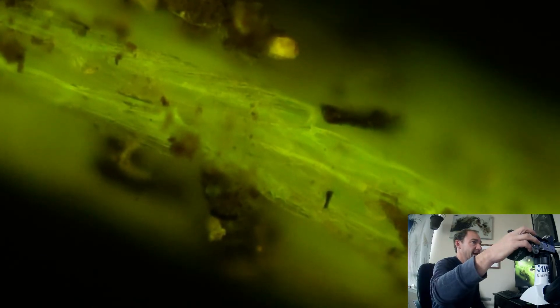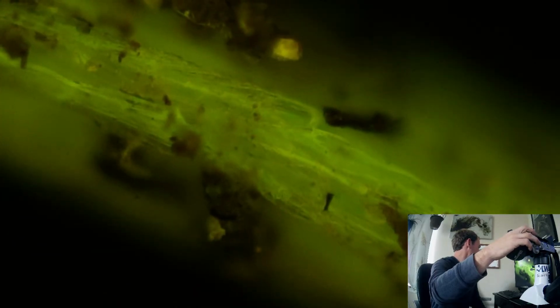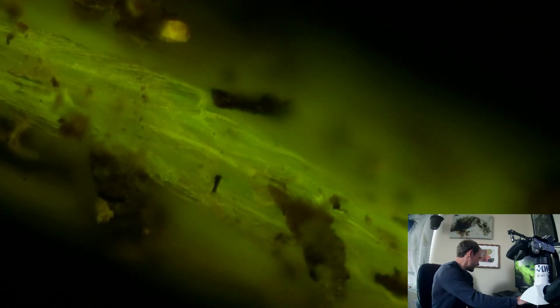Glowing super bright. Probably even turn down our ISO a little bit. Yeah, there we go. We're seeing a little bit more details. Yeah, it looks like there's a swarm of stuff going on in there, especially right over here in this bottom spot. Look at all these little glowing strands.